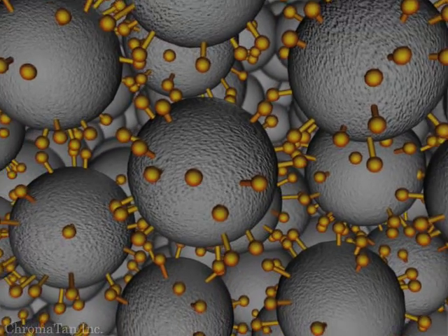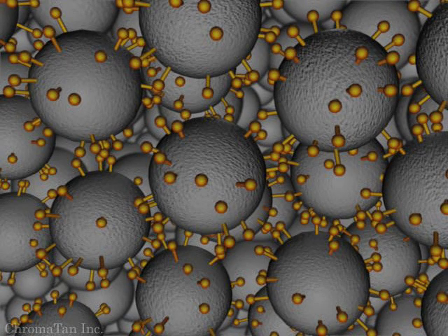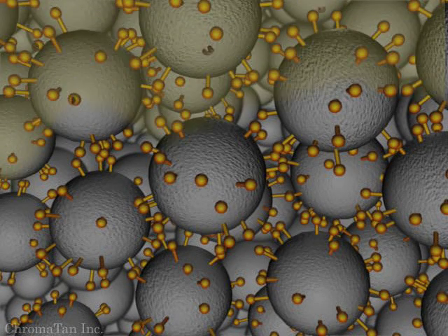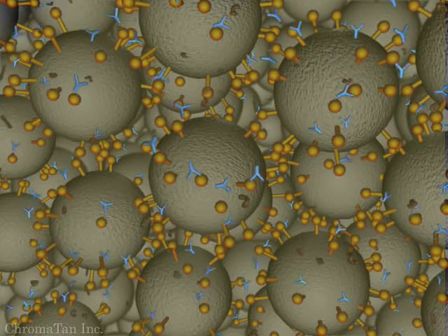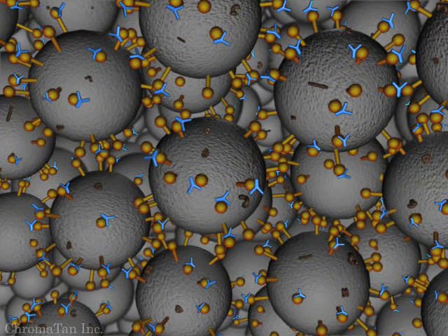A complete chromatographic cycle consists of four stages of operation. During the binding stage, the antibodies are bound to the resin while most impurities flow through.